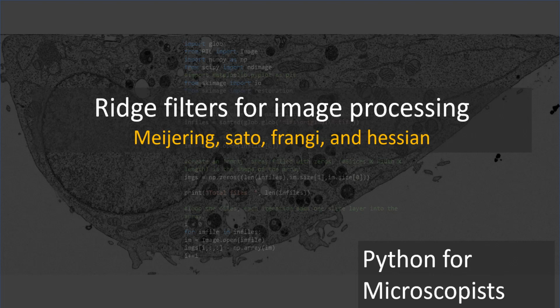Although I should say, based on my past experience, I never worked on any sample or any image that required this ridge filtering. But I'm recording this short video just to make sure you all know that something like this exists in case you work with these types of samples.